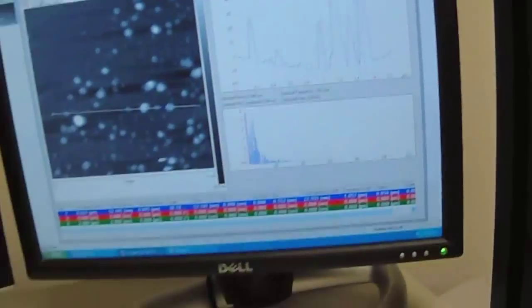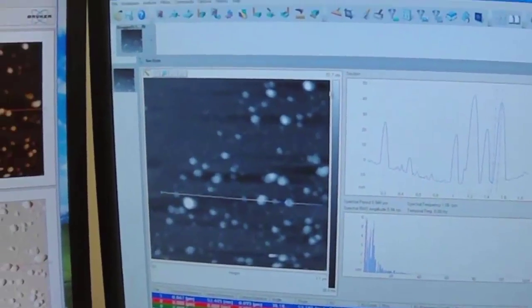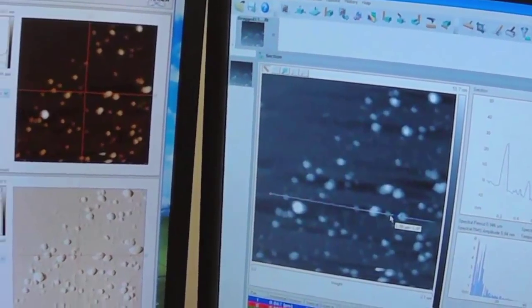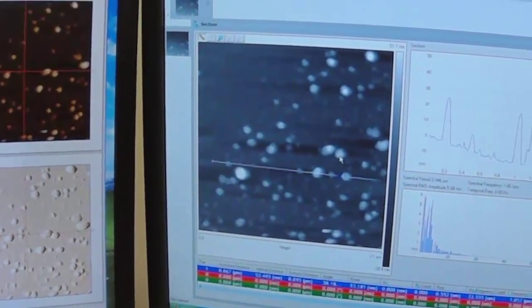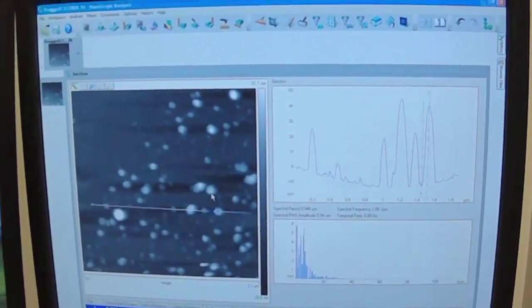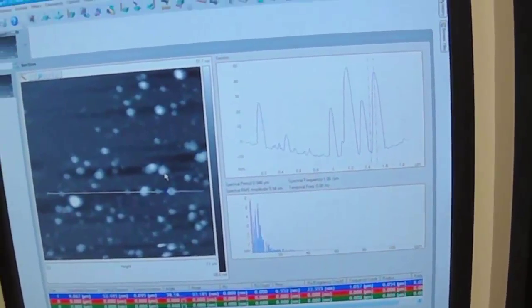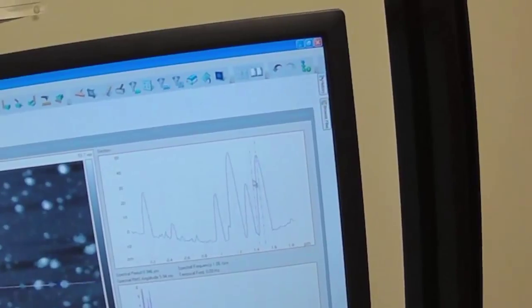So that's one particle. We want to start making a data table and measure as many of these particles as you can within a reasonable amount of time. You can't measure all of these particles, but the more you measure, the better your statistics are going to be to determine what is the average size of a particle and what is the particle size distribution.